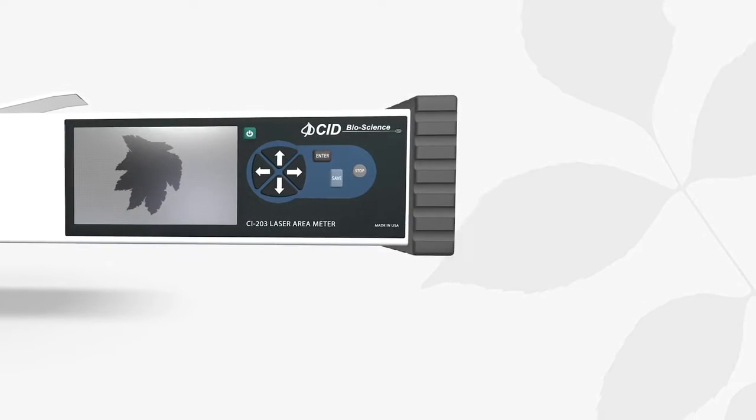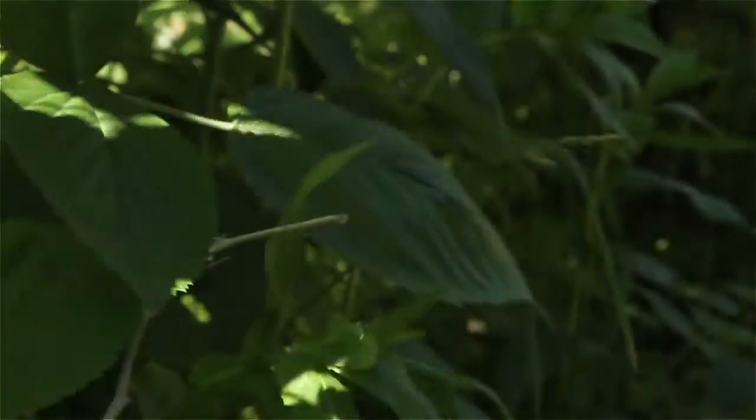Additionally, the CI-203 enables researchers to collect data from the same plant or even the same leaf throughout its lifespan.